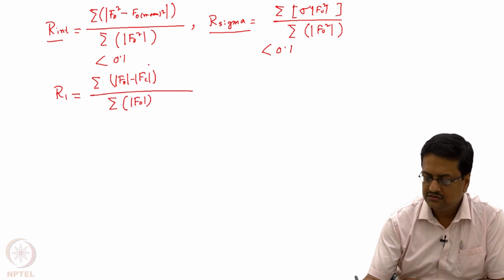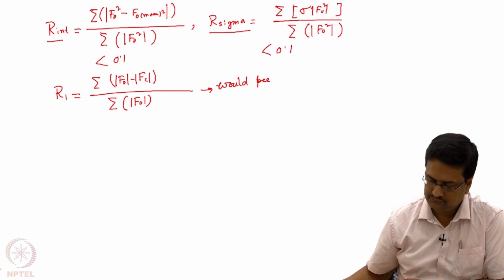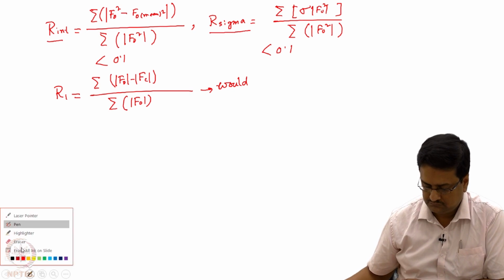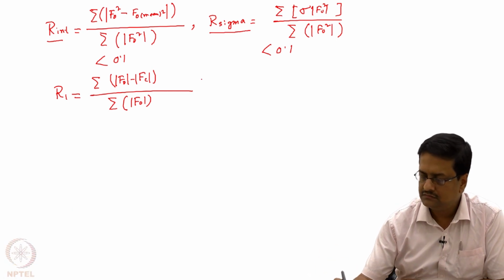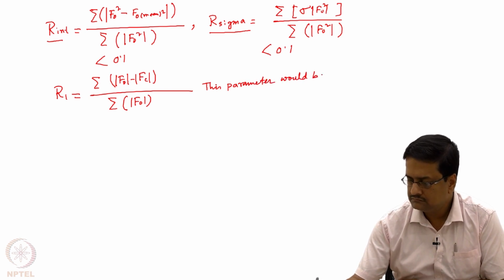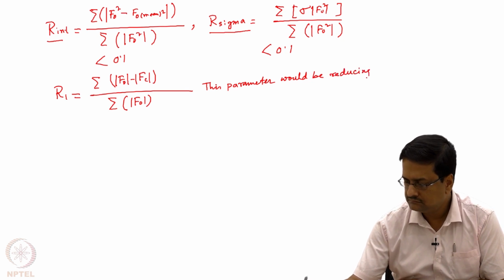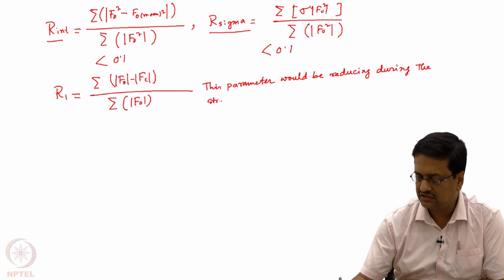That means this parameter would keep reducing during the structure refinement process.